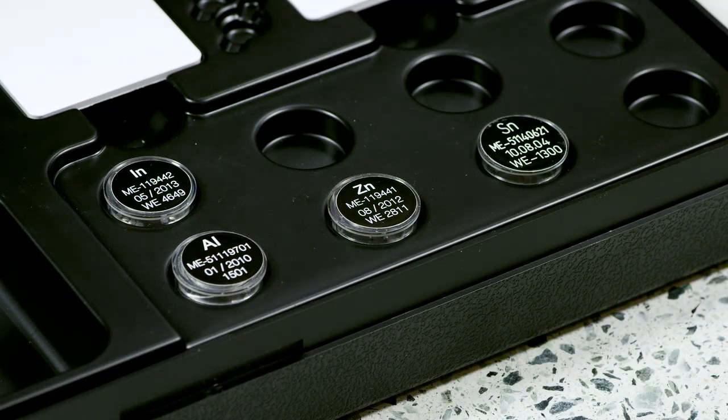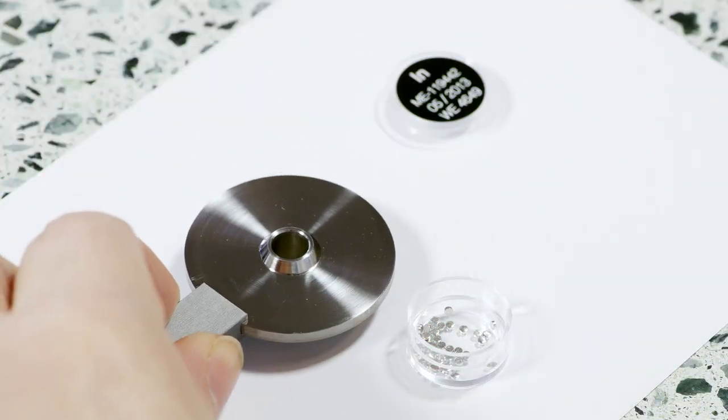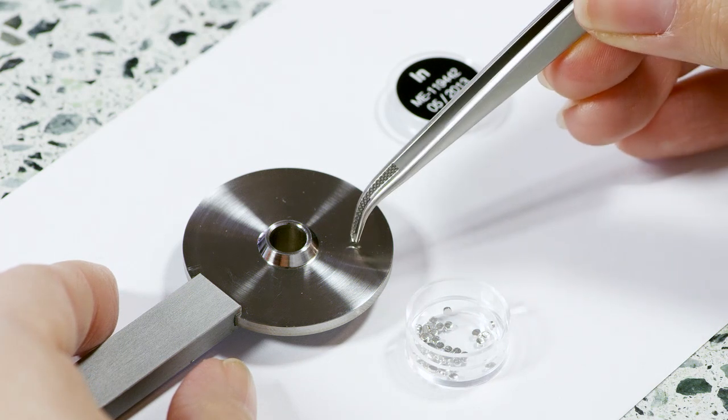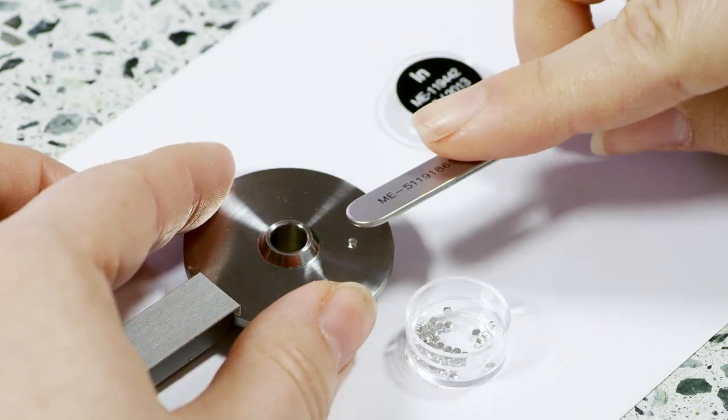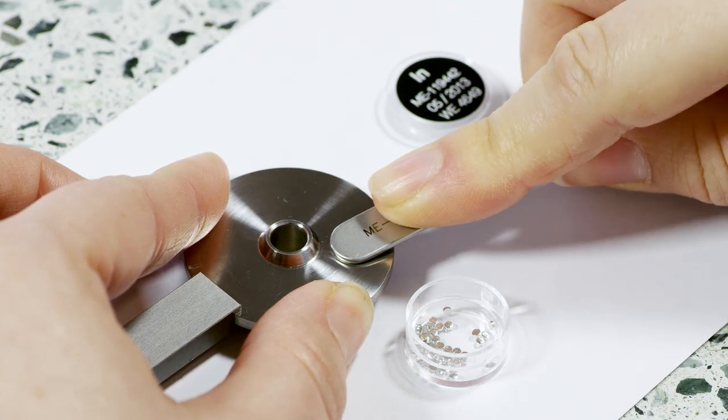Let's start with the preparation of the reference substance. We will use indium as an example. The soft indium pills can be pressed flat. The resulting sample shape provides better thermal contact.